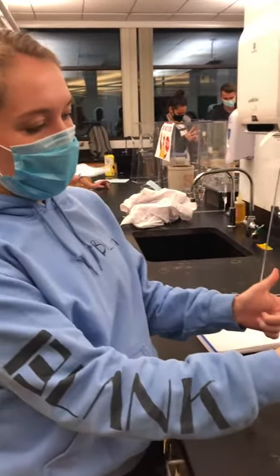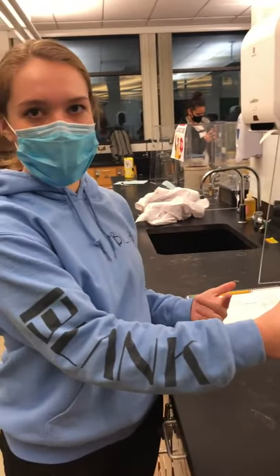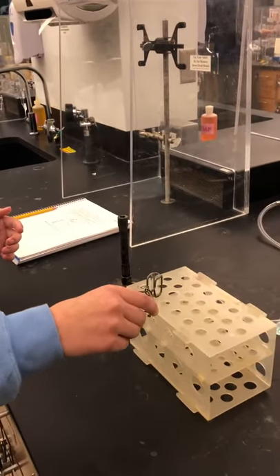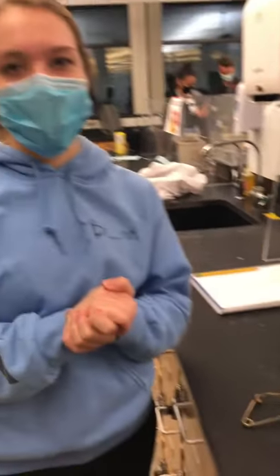You also want to tilt it away from you and from other people so that in case chemicals splash out it doesn't get on anybody. And then finally when it's heated up you place it back in a rack so it can cool before you touch it.